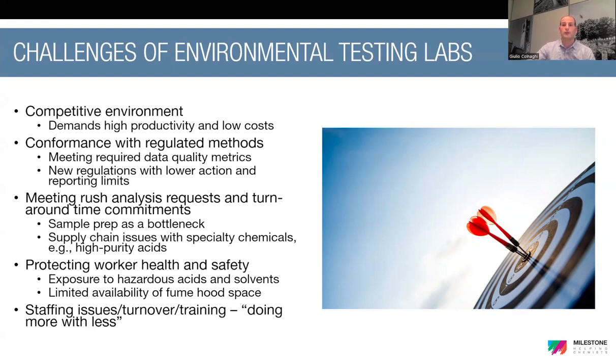And therefore, taking sample prep into consideration is important because sometimes it can be the bottleneck of the entire analysis process. But there are also other bottlenecks, such as supply chain issues, for example, for the reagents or for other consumables.